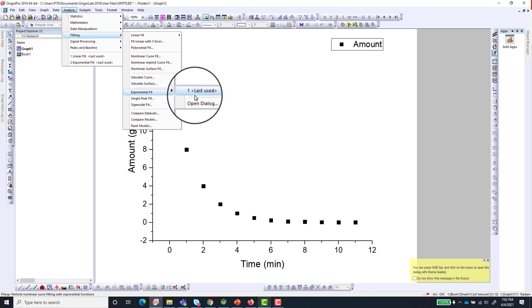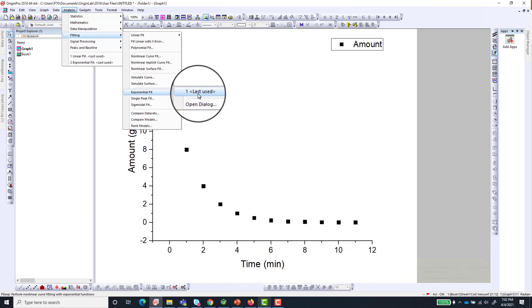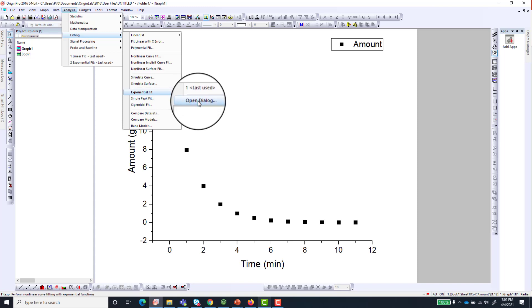We don't want to use the last use because you don't know specifically what method I used in my last fit. So let's just go to the Open Dialogue to be able to interact with the software and choose the right parameters for our fit.